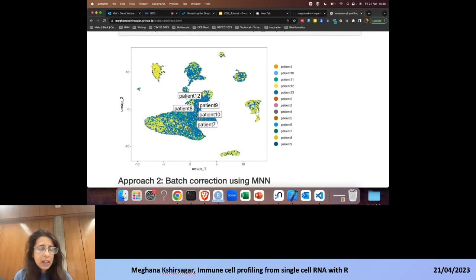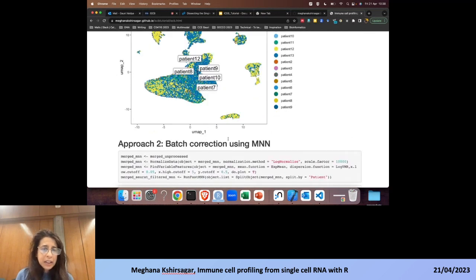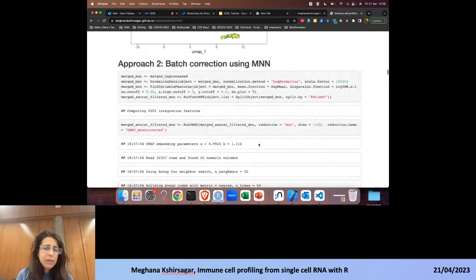So we went ahead and did the batch correction with another algorithm, that is MNN. Again we did the same thing over here. First we did the batch correction with MNN, and then we substituted the reduction here as MNN.